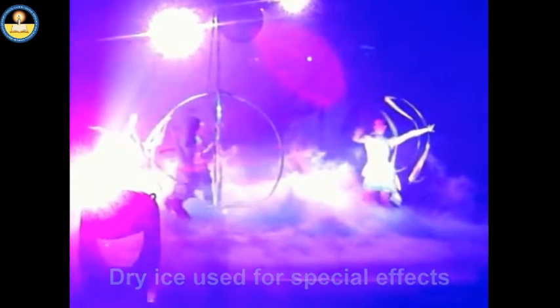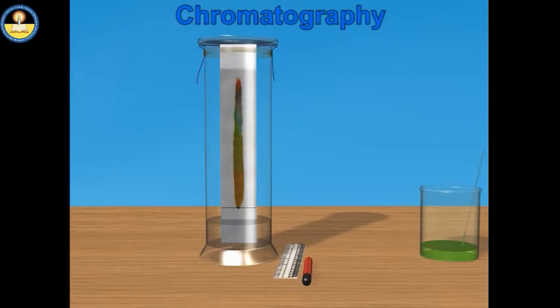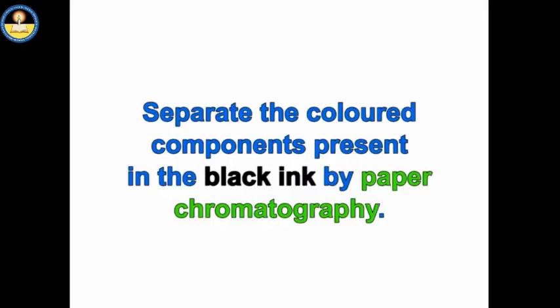Now, let us learn about the process of chromatography, by which we can detect the components of a mixture and can separate them. We will perform an activity to separate the colored components present in the black ink by paper chromatography.